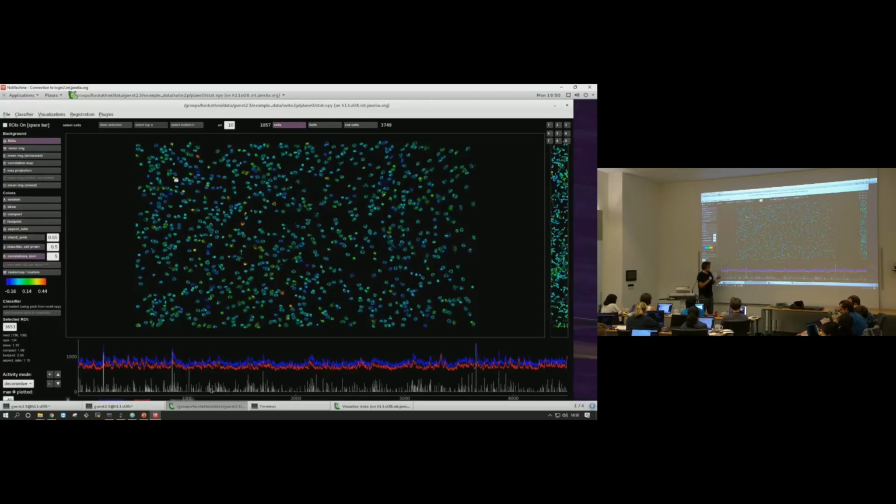But it still has a problem, right? That it has this long time scale of the GCamp that we know about that we'd like to get rid of, because we'd like to localize our events in our fluorescence in time in a more well-defined way. And so that's the process that we call spike deconvolution, or you might have heard of it as spike detection or spike inference or things of that sort. But at the end of the day, it's trying to be an estimate of the spike rates of the neurons in the different bins here.